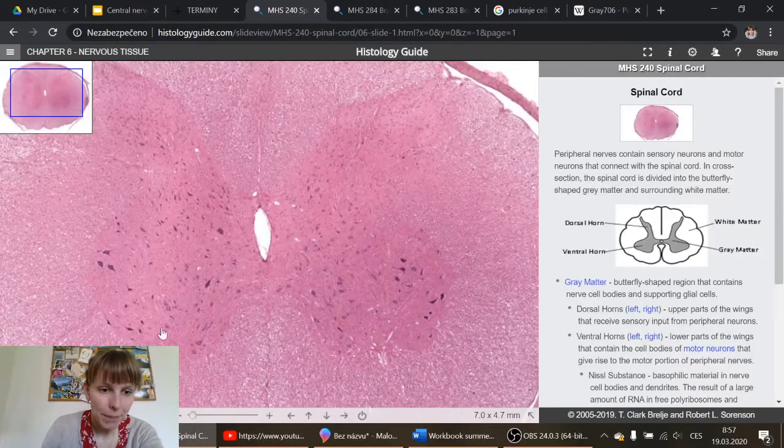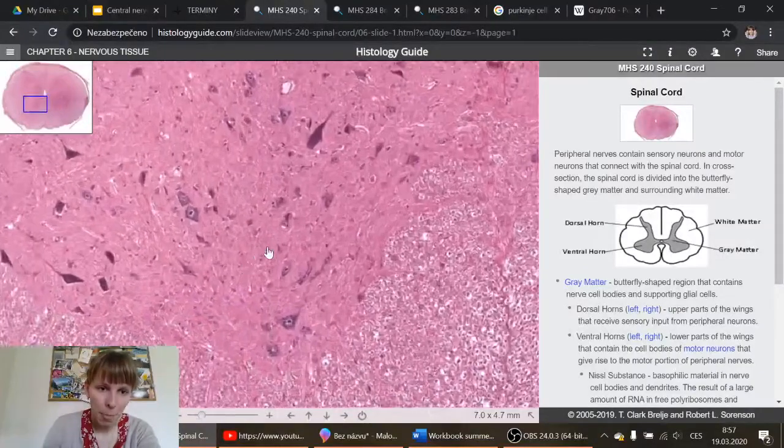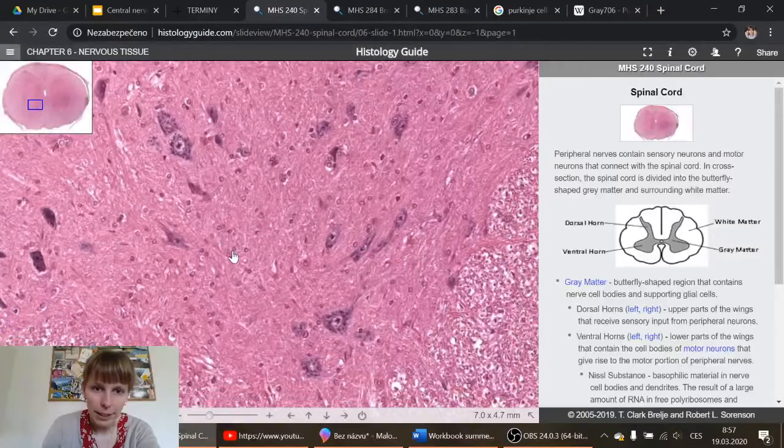So if you take a look from far away, you can right away say which part is the anterior horn with the motoneurons. So it's these two parts. These are the ventral horns, ventral, anterior, and posterior, dorsal horns here. So we want to zoom in into this part and take a look at the motoneurons. And they are here, pretty nice.